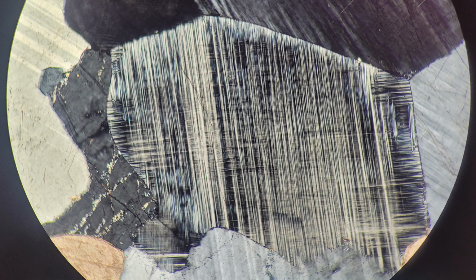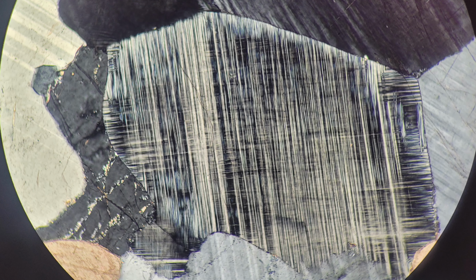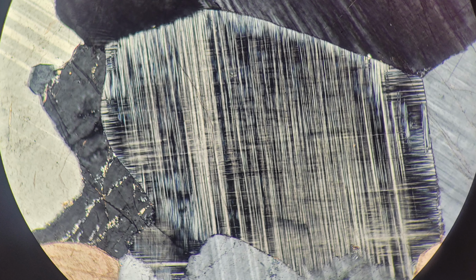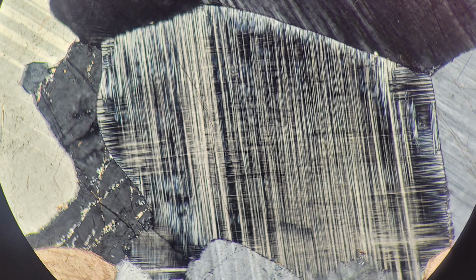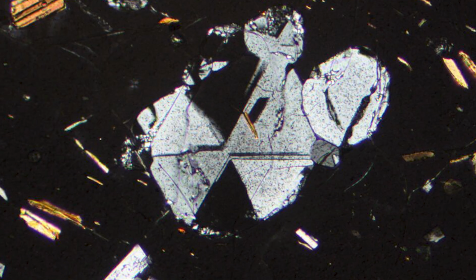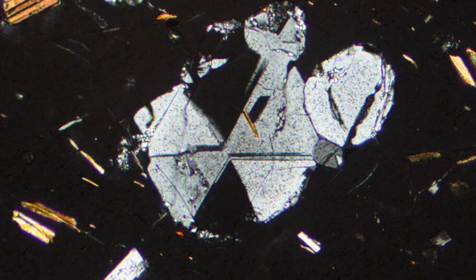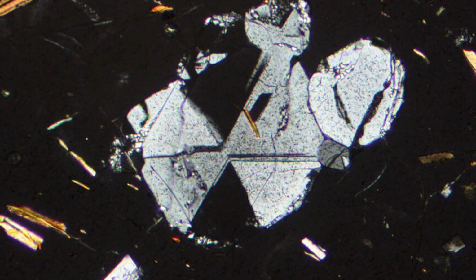Alkali feldspars such as microcline also exhibit tartan twinning, which looks like this weaved structure, but is actually a bunch of tiny lens-shaped structures due to a combination of albite and pericline twins. Some minerals also have cyclic or sector twinning, where they're rotated around an axis.